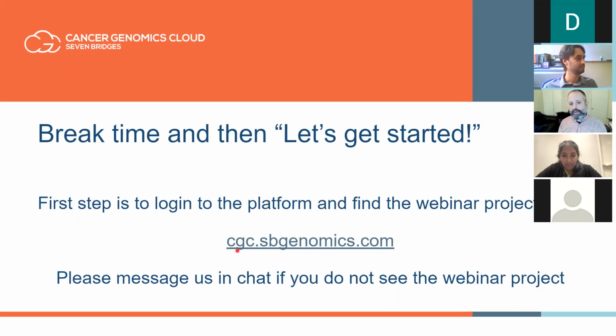I think most people have, but if you want to follow along, go to cgc.sbgenomics.com and make an account, and I can make a clone of the webinar project for you.